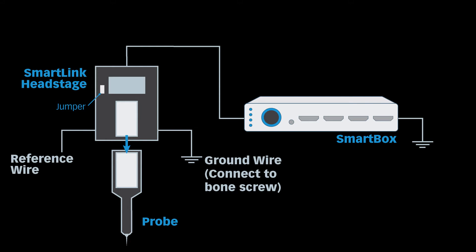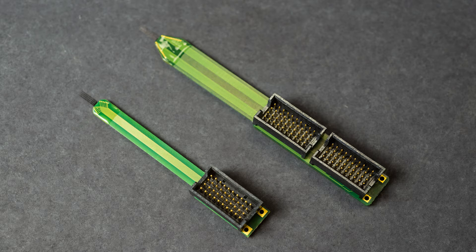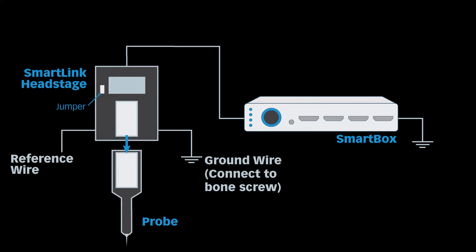For acute experiments, you should use acute smart link head stages, which have connectors that match Neuronexus acute probes. Other conventional probes can be used as well. Each acute smart link head stage has one reference wire and one ground wire, as well as a jumper. Connect the ground wire to the animal, for example via a bone screw. To measure voltage relative to local potential planes, implant the reference wire into tissue and remove the jumper from the head stage. To measure voltage relative to ground, leave the reference wire disengaged and connect the jumper.